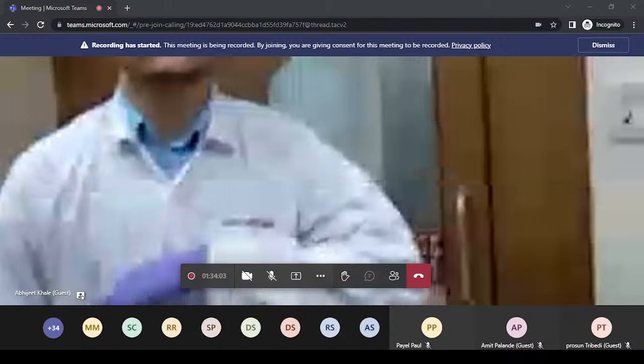Just hang the plate, 20 by 10 centimeter or less than that dimension. Pour in the mobile phase, that is 10 milliliter for chromatographic development and 25 milliliter for chamber saturation. And this is again software control with a humidity control option. So after giving the command from software, the plate will go automatically into the chamber, into the mobile phase, and after chromatographic development, the plate will come out from the chamber in the upper part. Plate drying is also automatic.